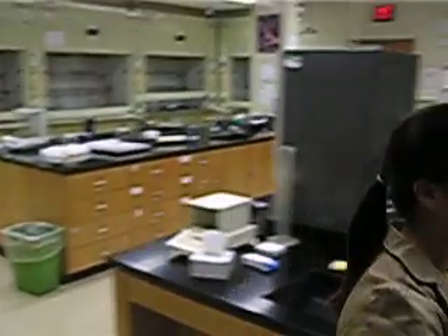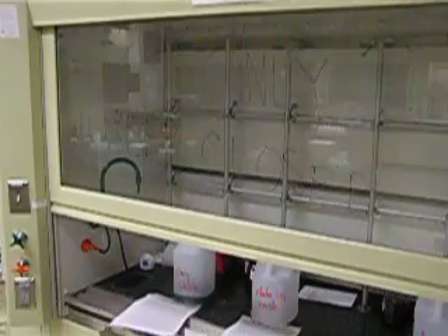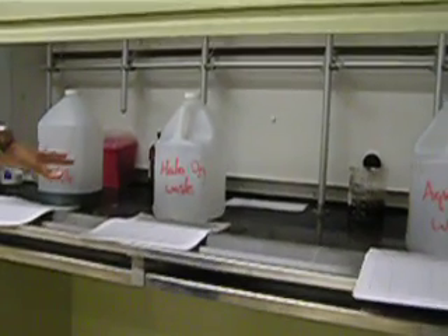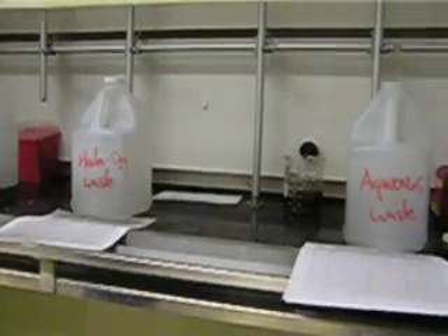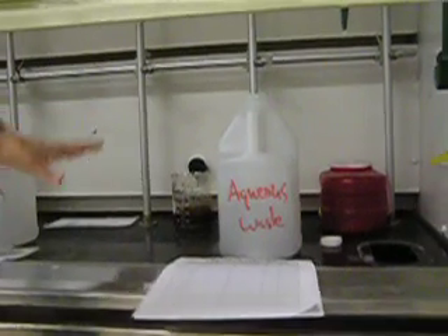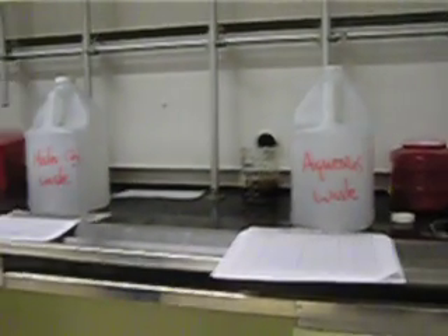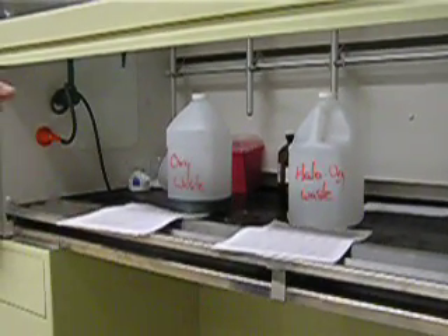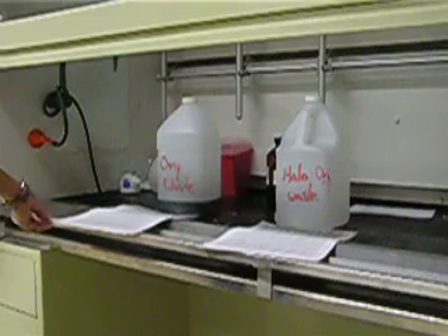The last place we'll look at is the waste hood. There are two important things to note. First, you have to make sure you put chemicals in the right container. The first container is organic waste. The second is halogenated organic waste — whether it's in an organic solvent or in water, put it in the halogenated organic waste. Last is aqueous waste, where you'll put salts, acids, and bases. Second, there are papers associated with each container — you must note what chemical you're putting in the waste and fill out the necessary information.